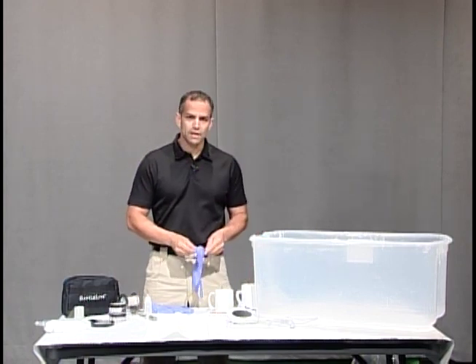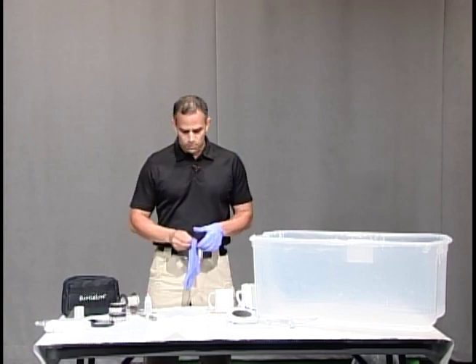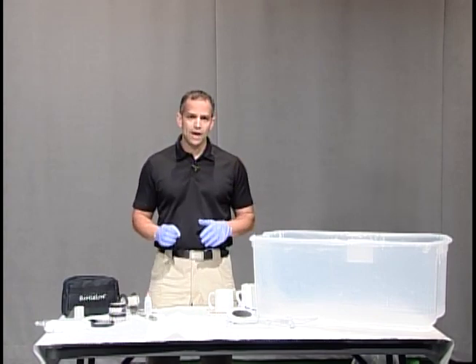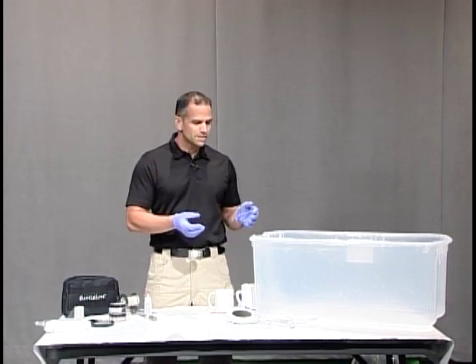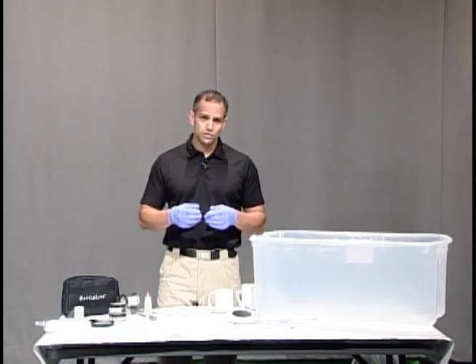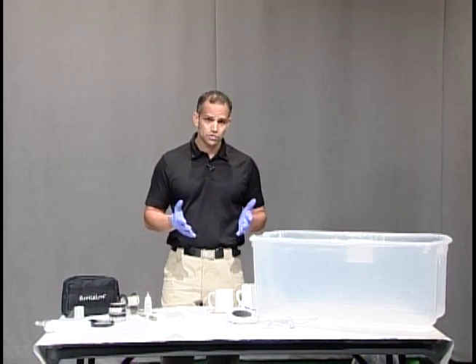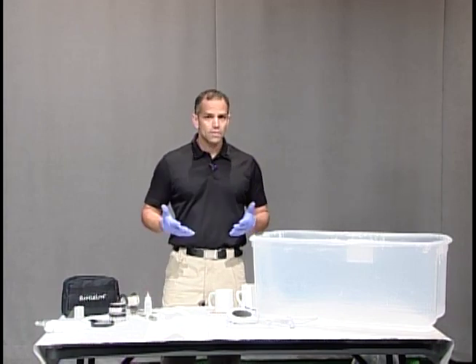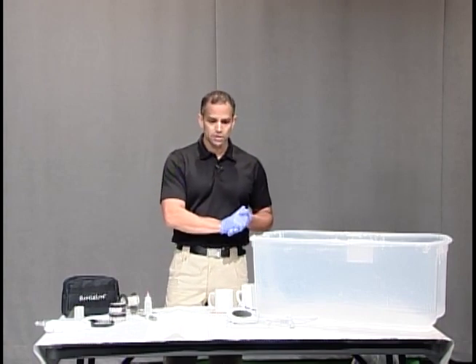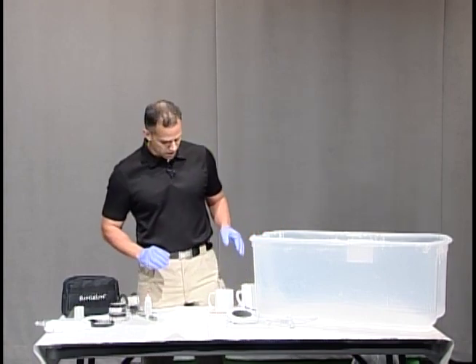The first thing I'm going to do is put my gloves on because we're going to be using super glue. When people talk about super glue fuming, they're talking about cyanoacrylate fuming. Basically what we're going to do is heat super glue so that it turns into a gas and then sticks to our fingerprint. That way we can process it just in case we make any errors — we would be able to process it again without losing that fingerprint.